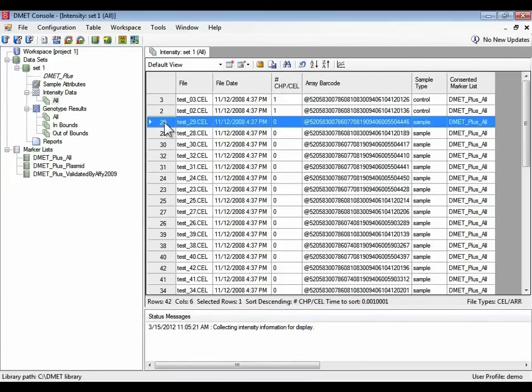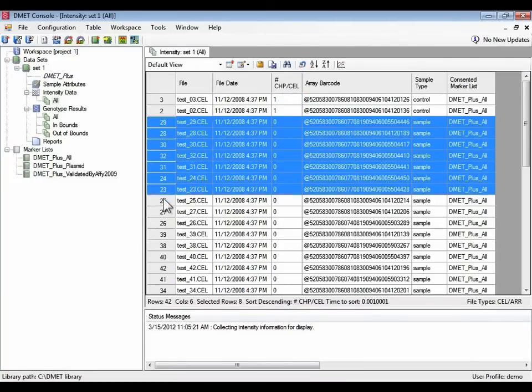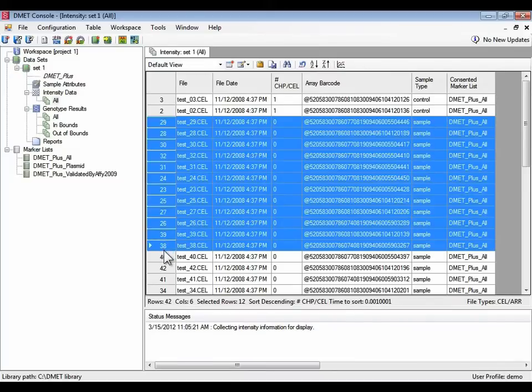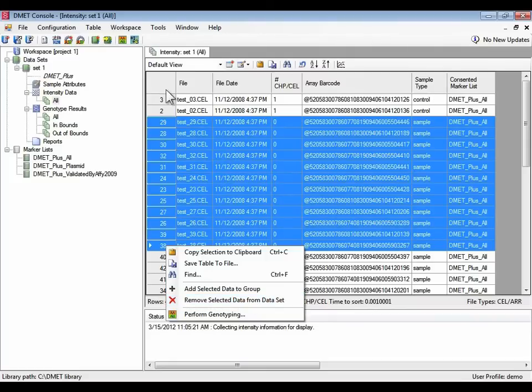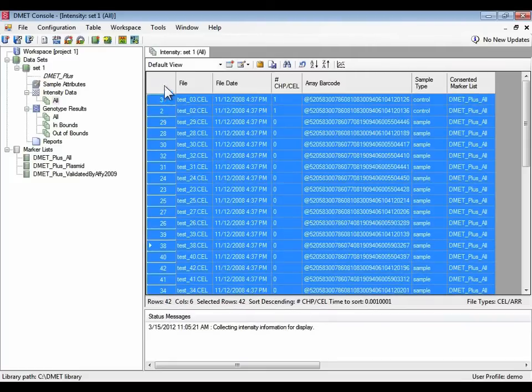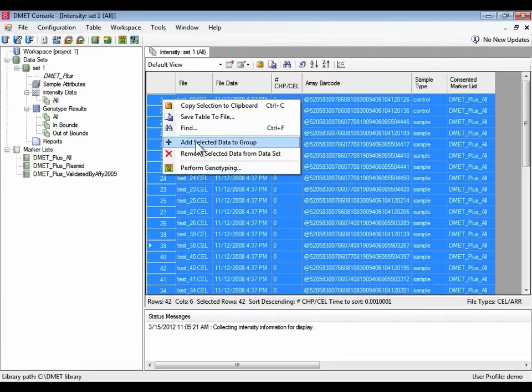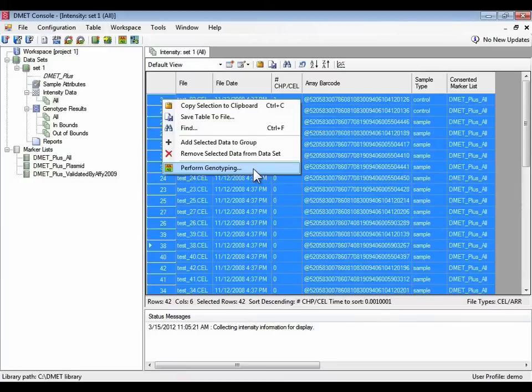So what I could do is I could select all the ones that haven't been genotyped and say perform genotyping. And that works just fine. I could select all these rows and say perform genotyping, in which case the two that have already been genotyped won't be genotyped again.